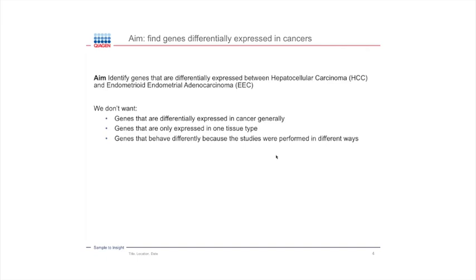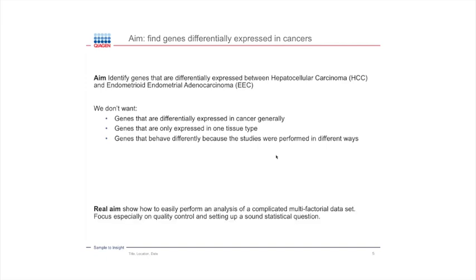And now just to break the fourth wall a little bit here, the real aim here is to show how to perform an analysis of a complicated data set. And these two data sets are very different. One of them's paired end reads, one of them's single end reads. And so I hope that the scientific question that I've come up with here interests you.